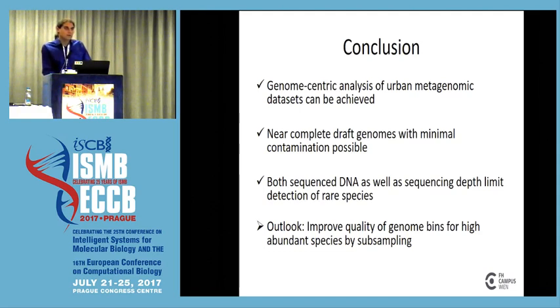But what is your expectation, eukaryotes versus bacteria? Is it true to say that assembling eukaryotes is much simpler, just because there is so much less gene transfer going on, for example, which makes your graph much simpler to assemble? If I would have a pure eukaryotic sample, probably, but in this very mixed one. But is it feasible to extract the eukaryotes and then assemble them separately? Well, if you map against a reference, you definitely can extract them and assemble them by themselves. I have to say that I did not try this out.